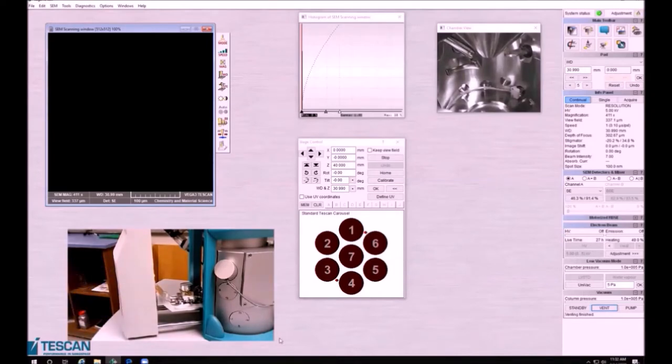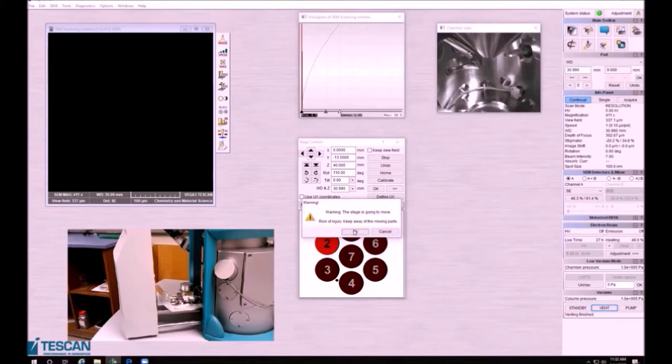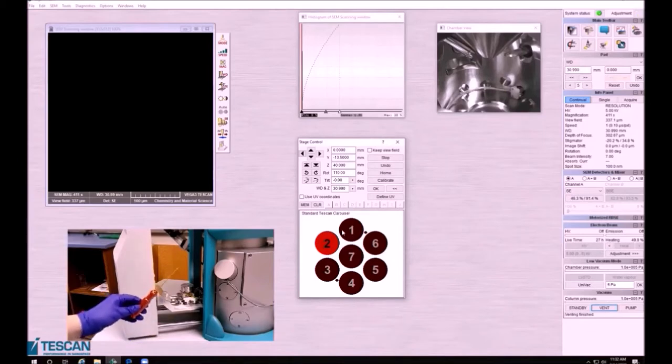You can see both on the instrument chamber in the live stream and on this screen that you can adjust the position of the stage. If you use these buttons, you can rotate your stage, which can assist you in loading your sample. You can also do this by clicking the position buttons. Now that it has rotated, I'm going to load the sample. You will want to screw the sample into place using the designated screwdriver. This holds the sample in place and gives you the ability to look at your sample from different angles without worrying that it may fall into the chamber.